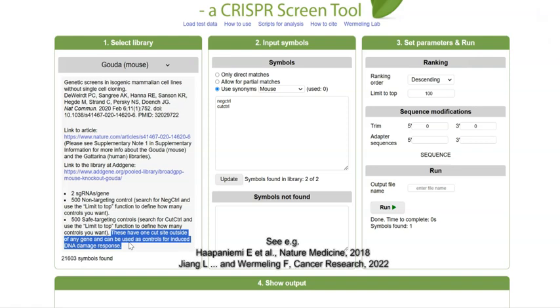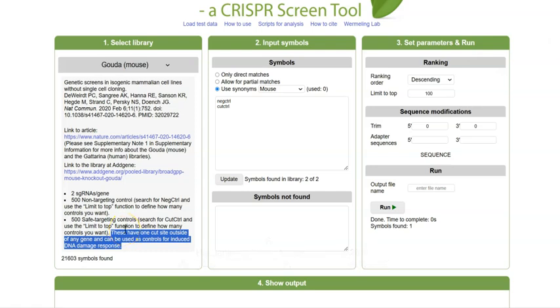That you're not only inactivating a gene, you're also activating a DNA damage response, and that could in certain settings affect your cells, especially if you combine several guide RNAs, and if those guide RNAs have several off-target activities, then you start to accumulate and actually can have a reasonably strong activity via activation of p53. So these types of controls could be interesting to include in the library.